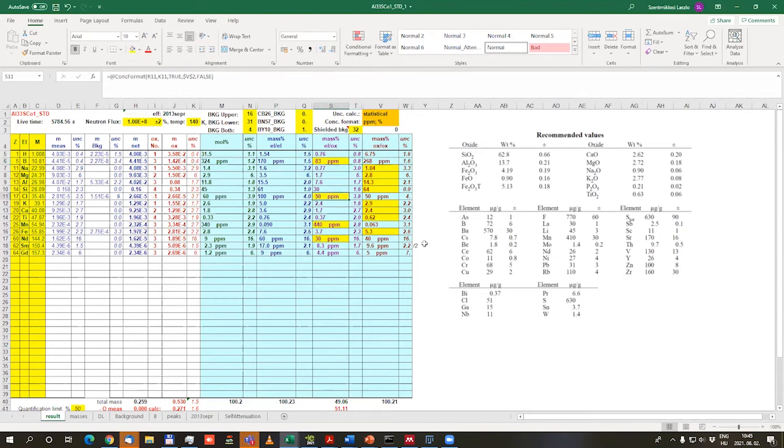Chlorine, we have 50 ppm certification, 51 ppm, and so on and so on. We have measured also samarium, gadolinium, which are not in this list, but we are still confident that these values are good. These are good indicator elements in the geochemistry, and that's why we like to analyze geomaterials, because neodymium, samarium, gadolinium, europium, so these rare earth elements are very informative for our geologist colleagues.